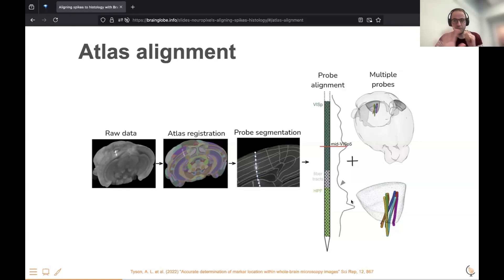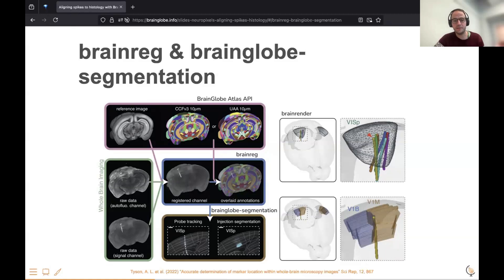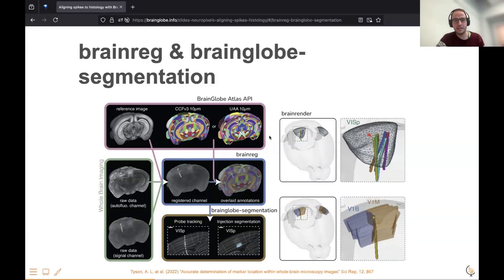Then you can compare the anatomical data with your electrophysiological data. The tools I'm going to demo are called BrainReg and BrainGlobe Segmentation. They are part of the BrainGlobe suite of computational tools for neuroanatomy. The first allows you to register your data to an atlas, the second allows you to segment out Neuropixels probes, and we also provide tools for various ways of visualizing the data.